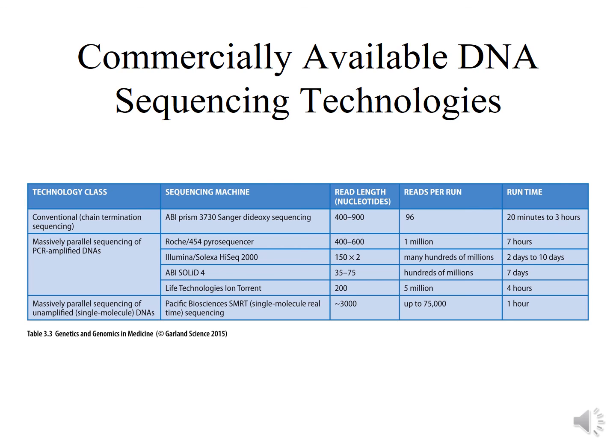By comparison with the standard Sanger dideoxy sequencing, the next-gen sequencing methods generally have high intrinsic error rates in base calling, but the final reported sequences are much more accurate than the initial reads after quality filtering and comparison of multiple read sequences. And, importantly, they have significantly cheaper running costs per base.